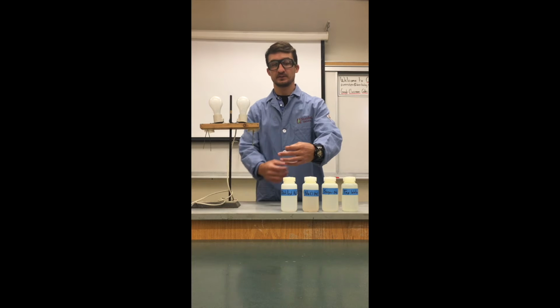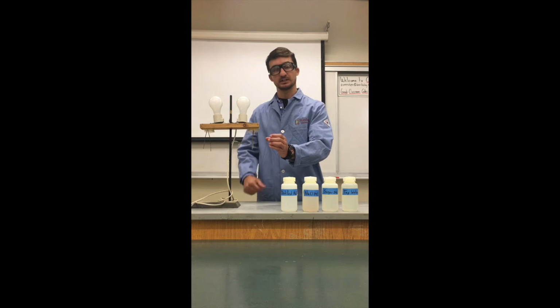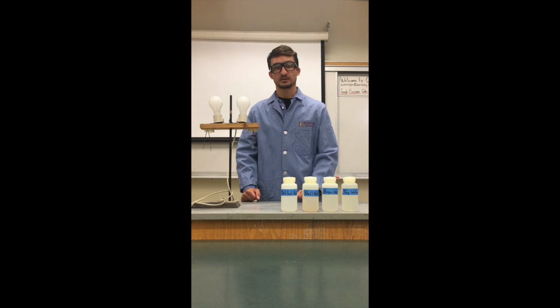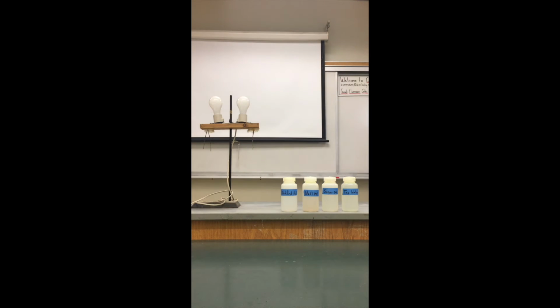And for each one of them, I will take the cap off and I'm going to submerge these electrodes into the water. Now to help us see, I'm going to turn the lights off in the room. Hopefully it'll help us see.